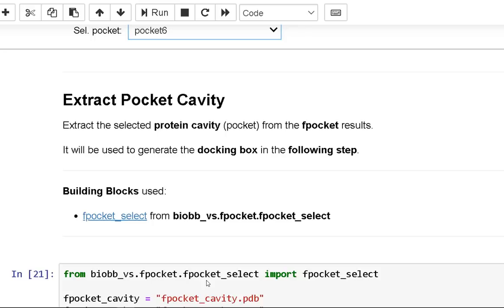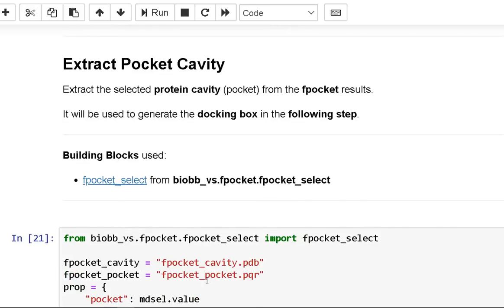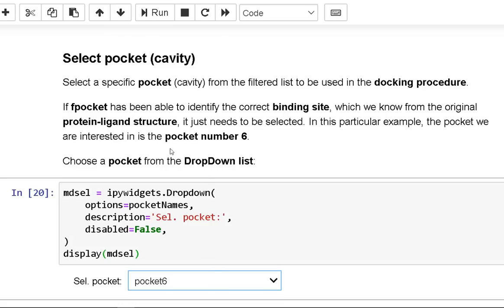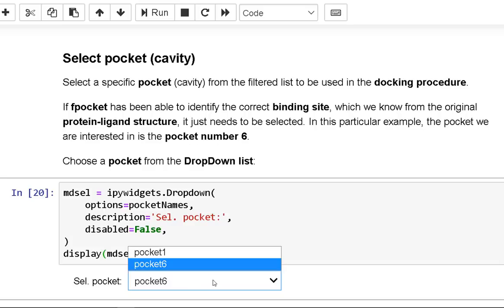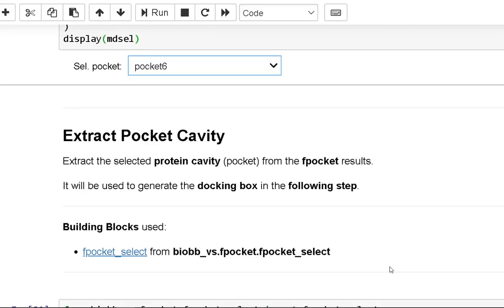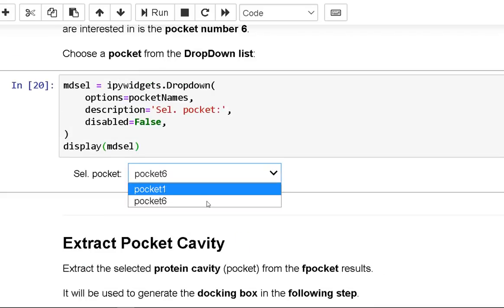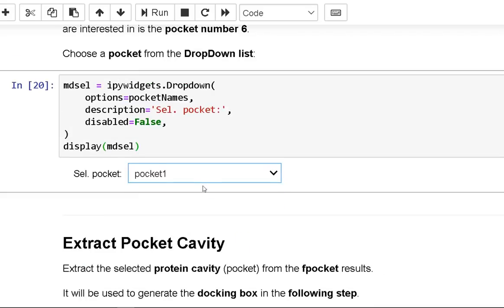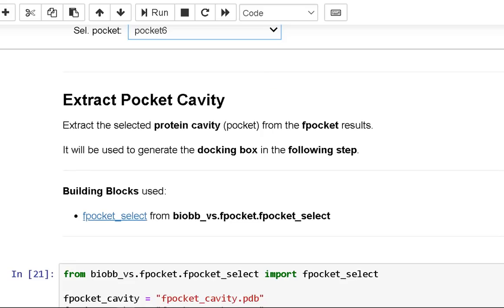Pocket number 6 is the one we are interested in for this scenario. From the drop-down menu, select a pocket to extract the pocket cavity from FPocket — this is the desired protein cavity. In the next stage, it will be used to create the docking box.